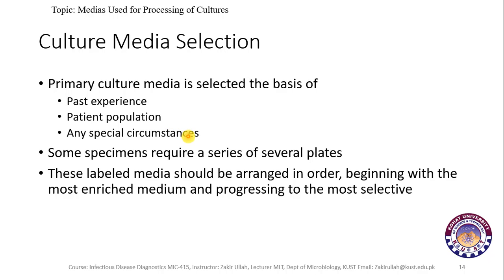And if there are any special circumstances, or if any special media is requested by the doctors, that media can be used on the basis of their requirements and circumstances. In some conditions, a series of different plates, multiple plates, is required. These plates, this culture media, are labeled and arranged in a specific order.